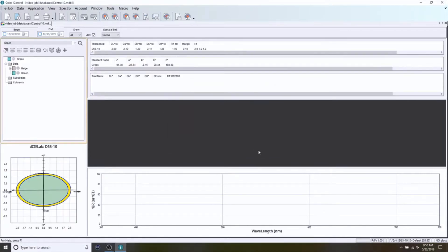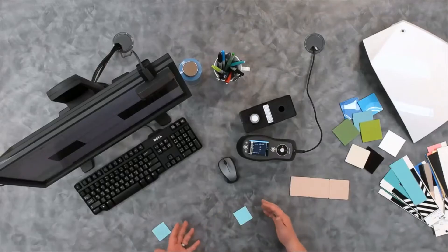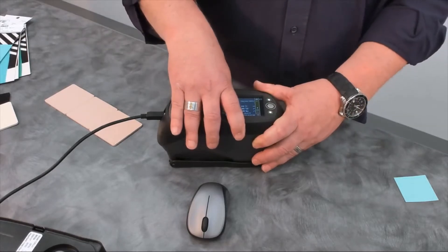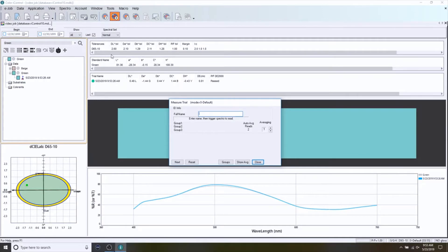I'm going to close that standard measurement window. You'll see both of my standards here — the little plus sign next to Beige indicates it has trials underneath it, while Green does not. Now I'm going to measure a single trial against that Green. A tip here: if I don't want to take time to name all of my trials, I can simply take a measurement on this screen and it will automatically identify the trial with a date-time stamp. Sometimes the naming of the trial isn't as important to us as when we measured it, so we can simply use that information. You can see this one passed as well, but we're in a more realistic situation — we've got a 0.81 Delta E on this particular sample. We can see it plotted over here; it's green because it passes and it's inside the ellipse. The yellow area in my ellipse would be my action limit area or margin.